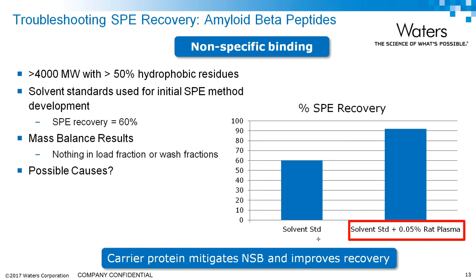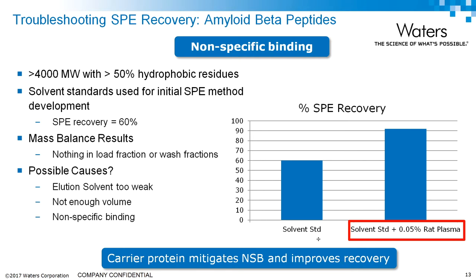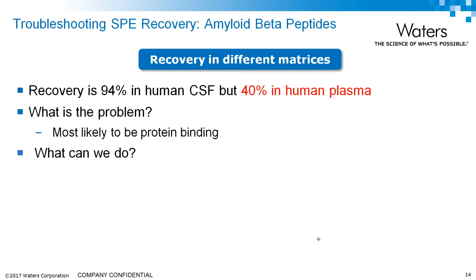Here's a quick example speaking of nonspecific binding — an amyloid beta method. It's a very large, very sticky peptide, so it's common to use solvent standards during method development. When we did that, recovery was 60%. We checked the mass balance — looked at elution recovery, load fractions, wash fractions — and didn't find anything. The most likely cause, given the characteristics of this large sticky peptide, was nonspecific binding. Once we added carrier protein, recovery went right up over 90%.